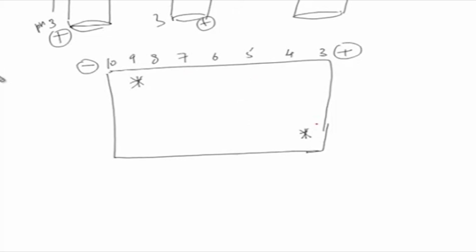if the protein pI is around 6, then this will migrate towards this side and this will migrate towards this side, and finally, they will settle down at pH 6, or they will focus at a particular pI value. So, this is how you can focus. You can see that because of the pH gradient due to ampholytes, the proteins loaded anywhere will come and focus at a particular place in isoelectric focusing. So, that is why the name is so.